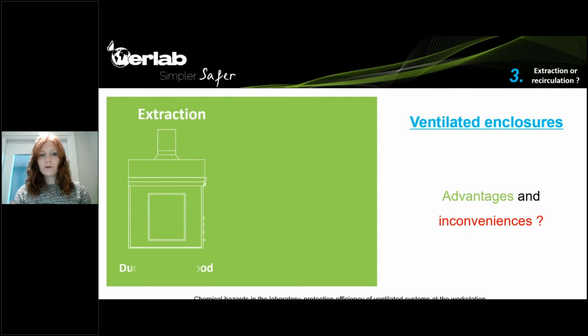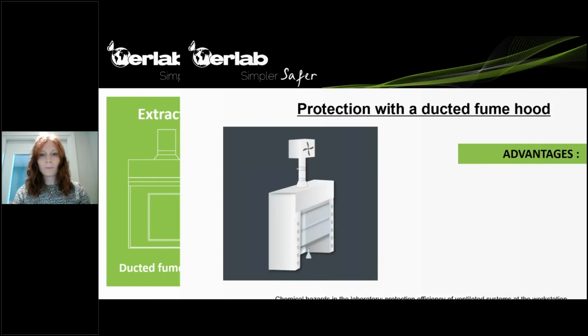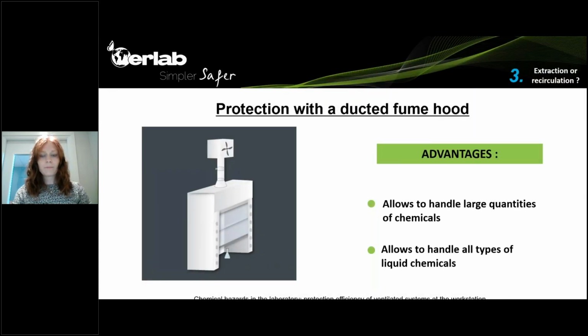So as you see, you have two different options, but what are the advantages and the inconveniences of both, and how to choose? So we're going to first have a look at the ducted fume hood and the protection that you get thanks to it.